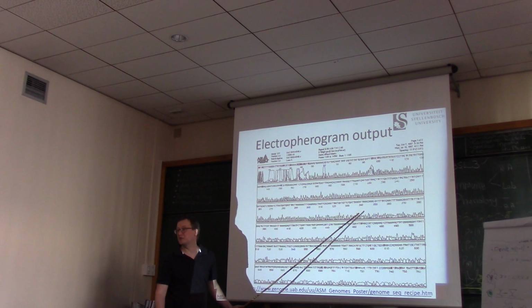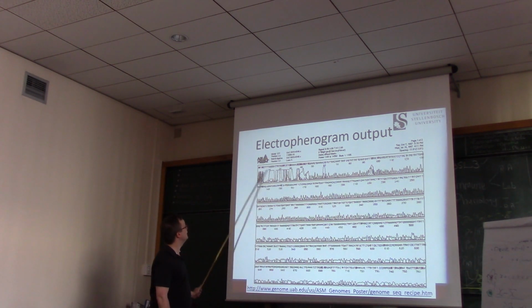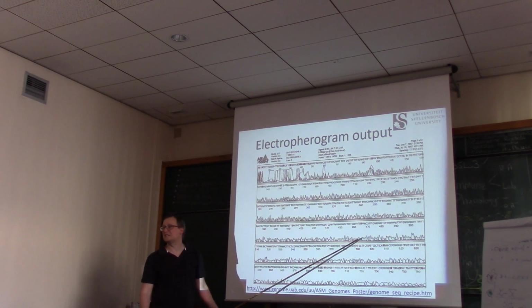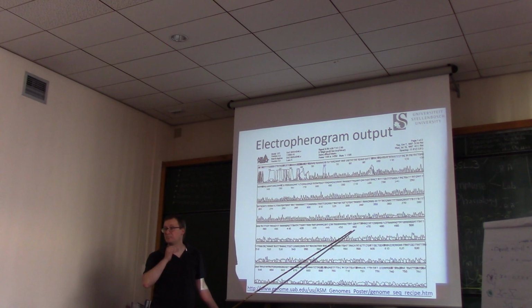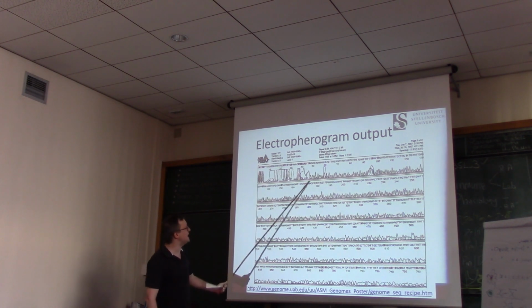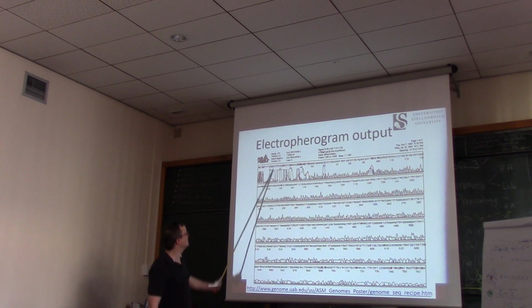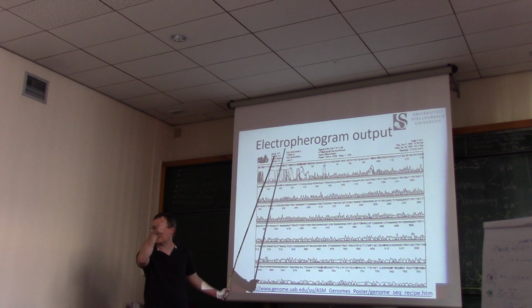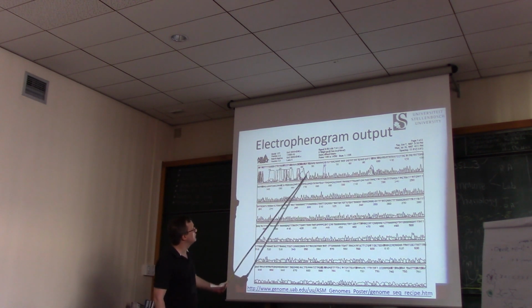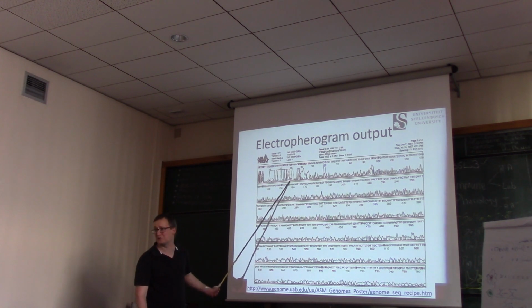However, I would point out that there are some regions of this electropherogram that are quite a lot messier. So look at this part up front. I think most people realize that the separation that's taking place in the capillary electrophoresis is doing an absolutely lousy job with all these products up front. The dye signals are saturating the detector, and it's not separated at all. So at some point, we switch over to well-behaved electrophoresis, but that very first part is trash.